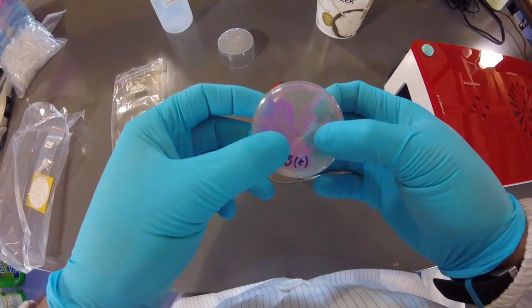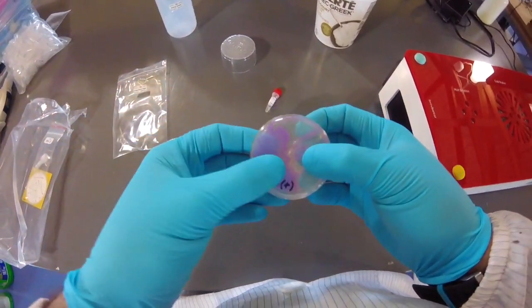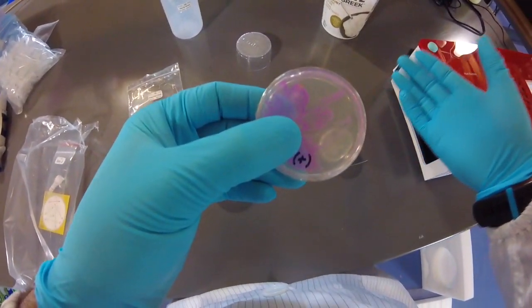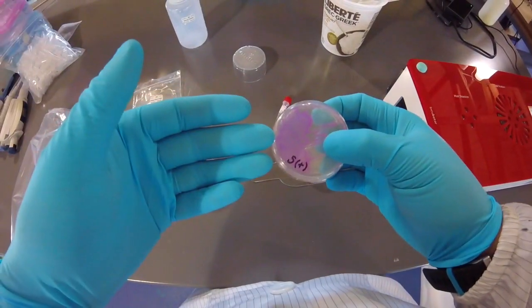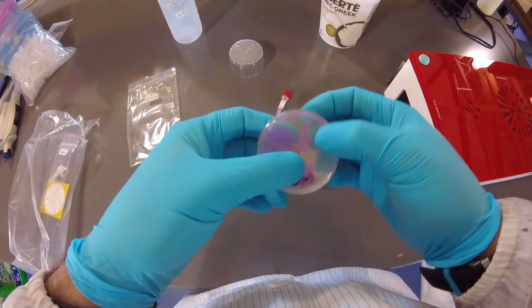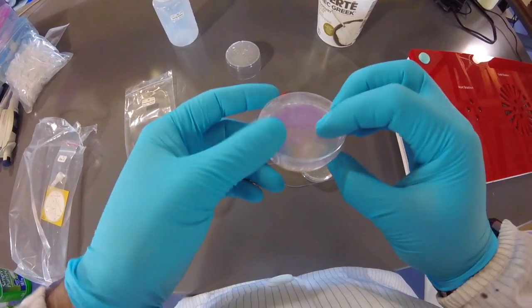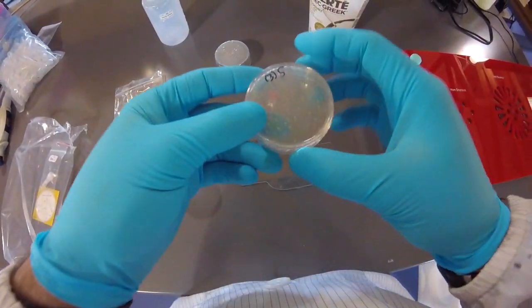So this suggests that the Petri dishes were made properly when we compare the negative control, where non-engineered cells didn't grow, and the positive control, where engineered cells do grow. It tells us that there's the right amount of antibiotic and selection, okay? Great, that's fantastic. And then, here's our results plate.